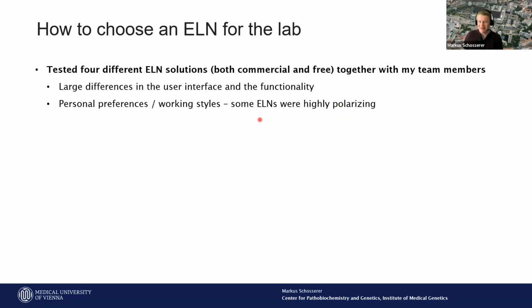We immediately saw that there are large differences in the user interface and the functionality. Therefore, of course, these ELNs are highly personal. Some people will have a certain preference for one solution or another, depending on the individual working style. We also saw that some ELNs are highly polarizing. Some ELN solutions, some people really loved and some people completely hated, again depending a lot on the individual working style.